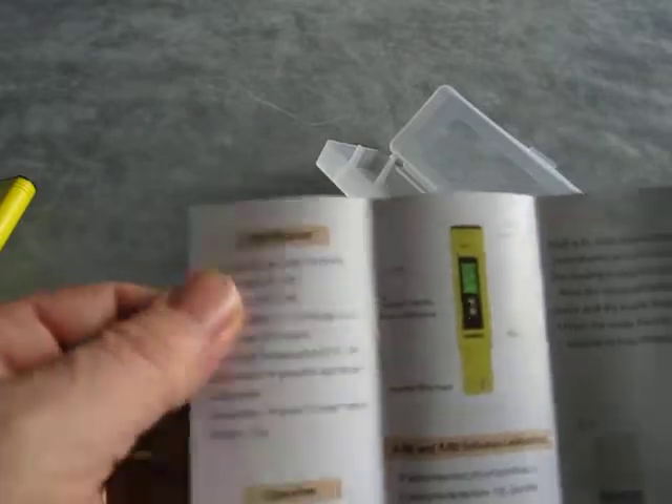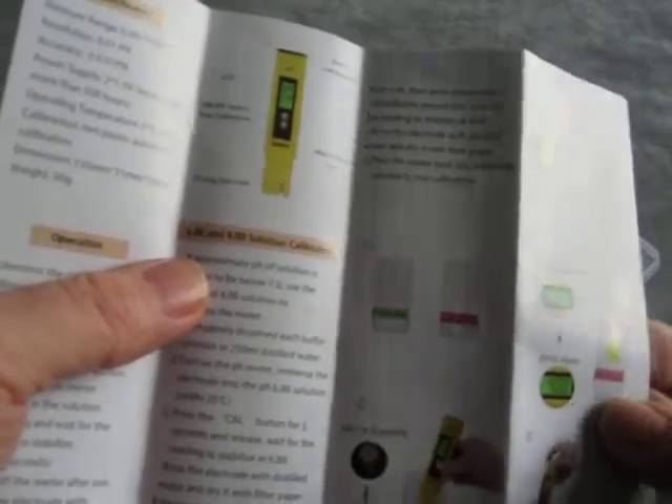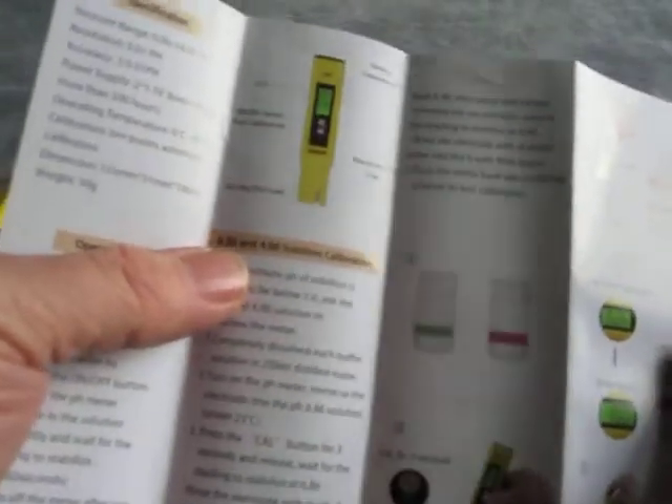The leaflet covers all the specification and general operation, and then explains step by step exactly how to calibrate with the 6.86 and 4 solutions, and on the back the 6.86 and 9.18 solutions. It's also got some notes and information about recalibration and batteries.